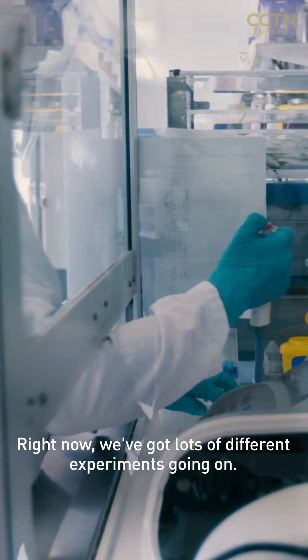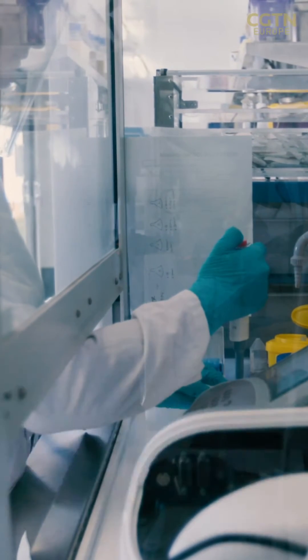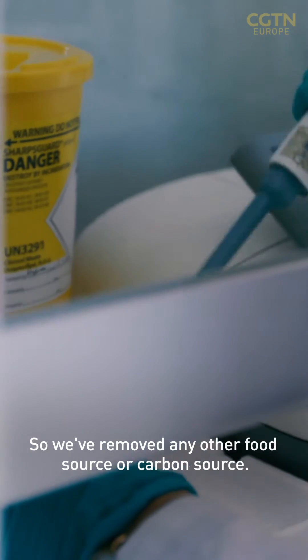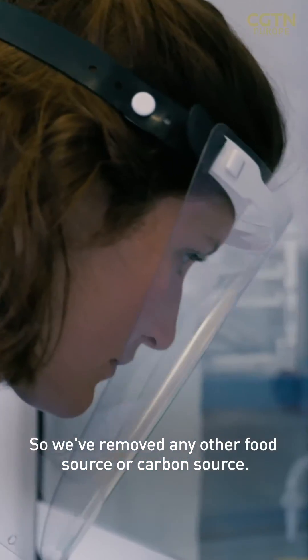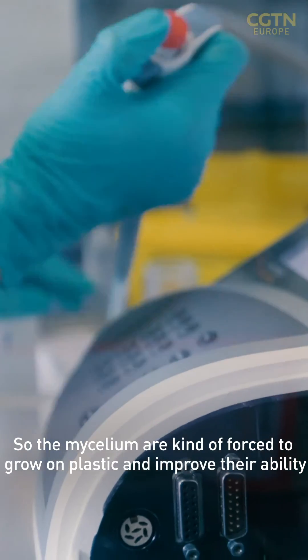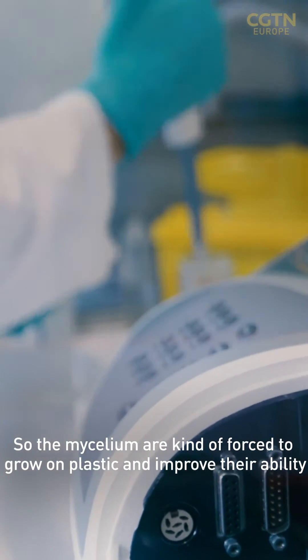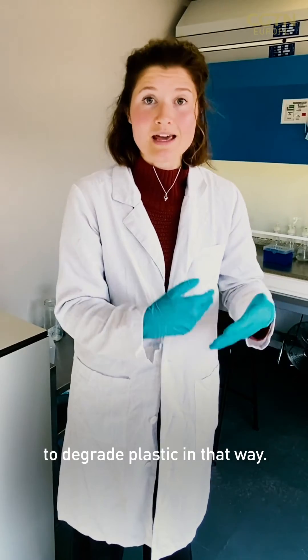Right now we've got lots of different experiments going on. We've got some directed evolution experiments going on, so we've removed any other food source or carbon source, so the mycelium are kind of forced to grow on plastic and improve their ability to degrade plastic in that way.